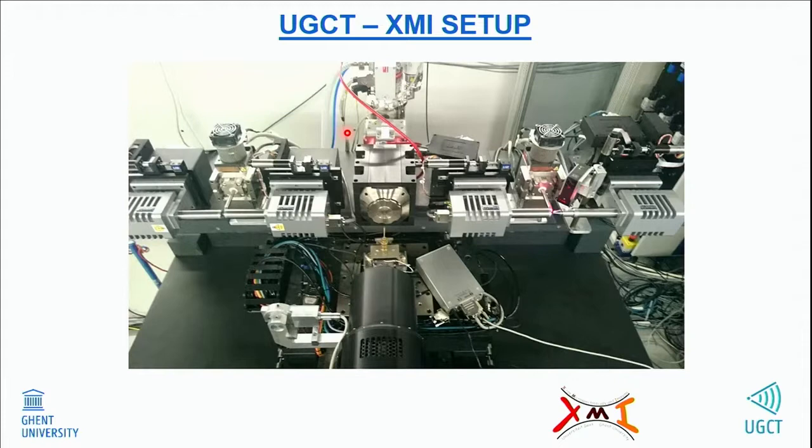So one confocal XRF, one XRF CT system, which are then combined. Of course the control software is slightly different because instead of one X-ray source you suddenly have three X-ray sources which have to run completely independently. You have to move your sample from one stage to another stage, etc. But that was all possible within the framework of that software as well.